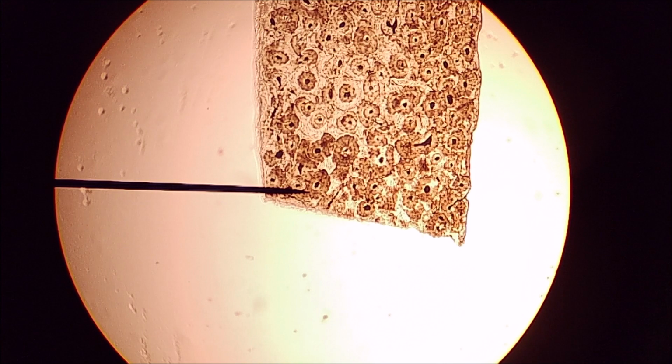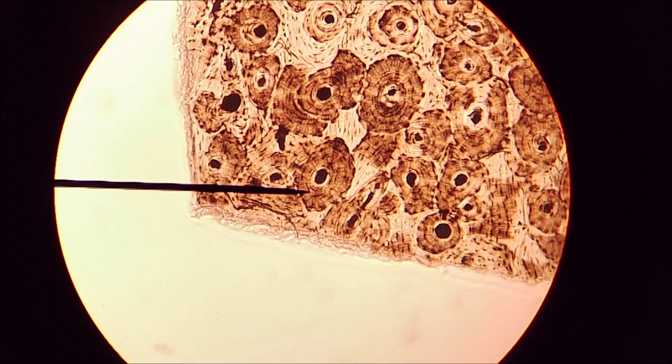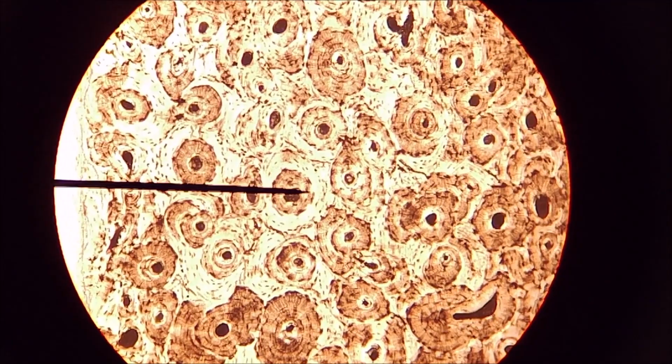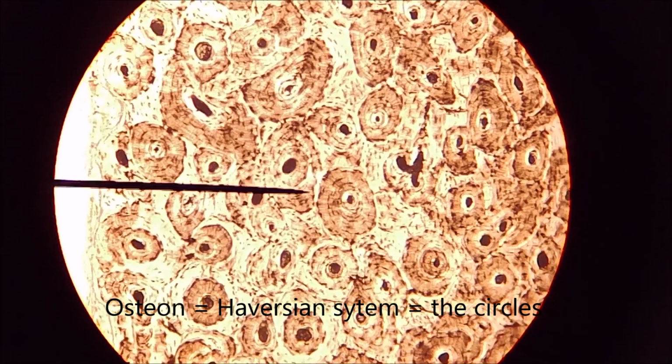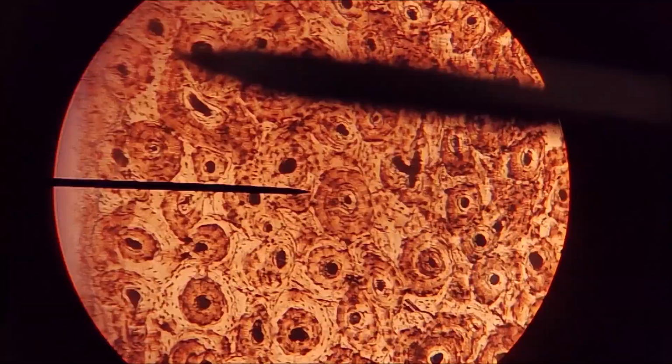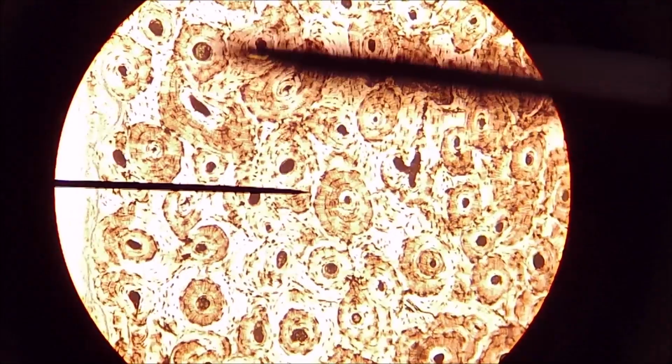What we have here is a bone slide. Now, bone is very obvious. Start to zoom this in, you get these very distinctive tree rings. Each individual circle there, folks, is what's referred to as an osteon. Okay, so each little circle, like here's a whole circle. Let me get the pointer. Like all that, there's an osteon. Here's an osteon. Here's an osteon. Here's an osteon. There's one over there. All the circles, those are osteons.